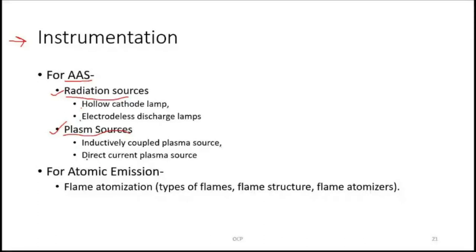For atomic emission spectroscopy, there is flame atomization. In this, we will study the types of flame, flame structure, and flame atomizers.